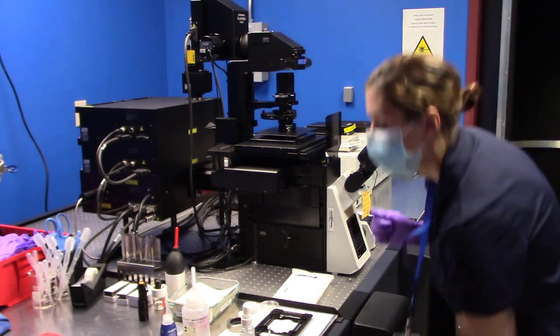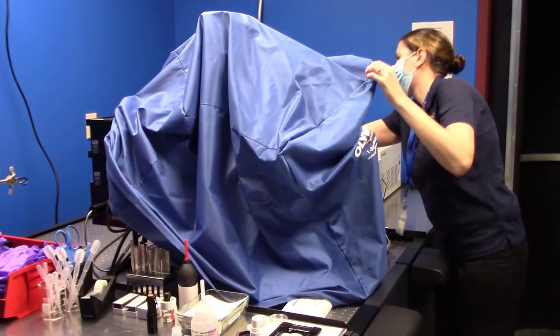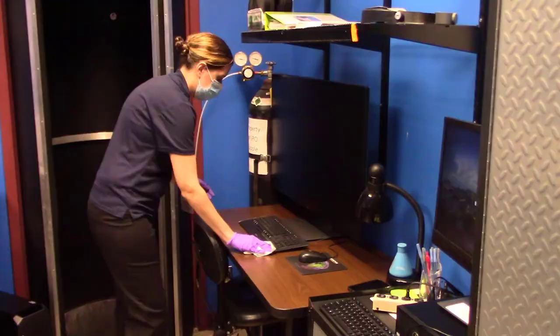Disinfect the microscope and computer work area. Cover the microscope with a dust cover. Clean up the sample area, log out of the log notebook, and FOM.